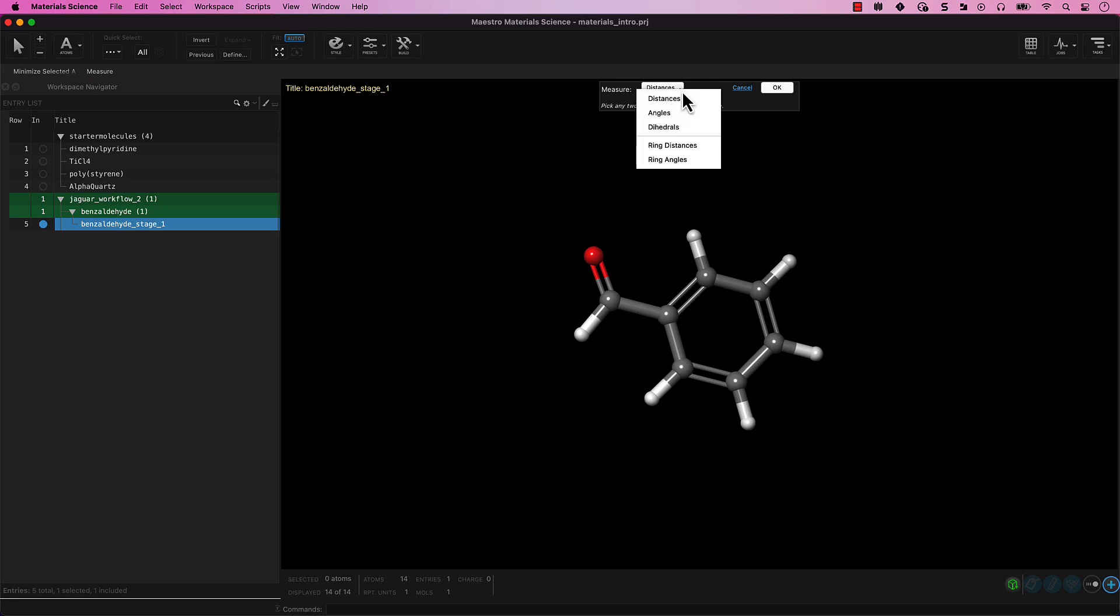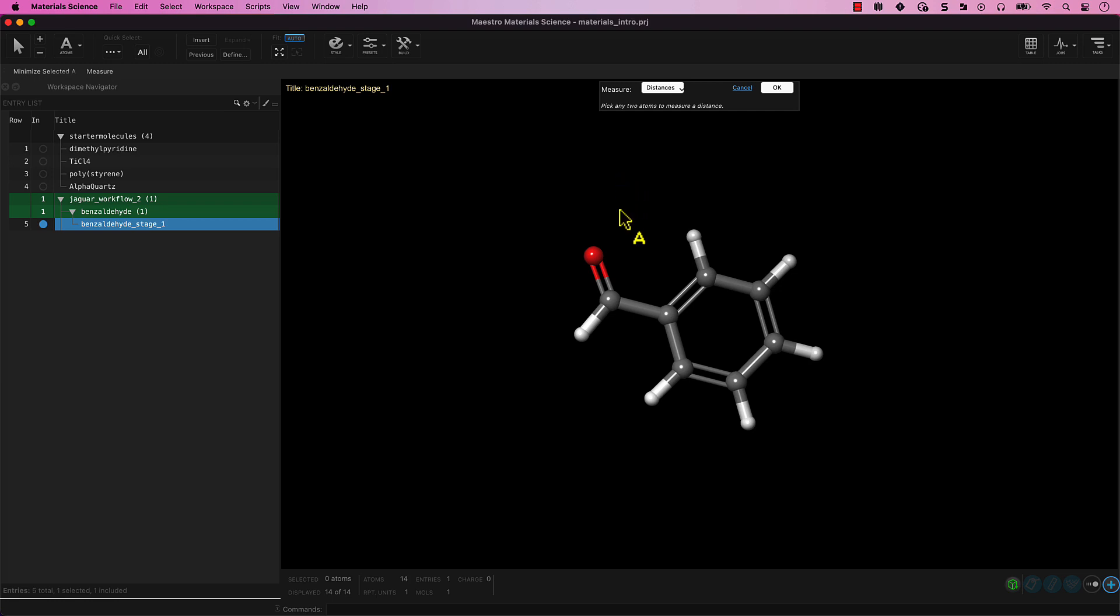Distance, angle, dihedral, or more. Each option will give you instructions for what to do next. Distance is the default.